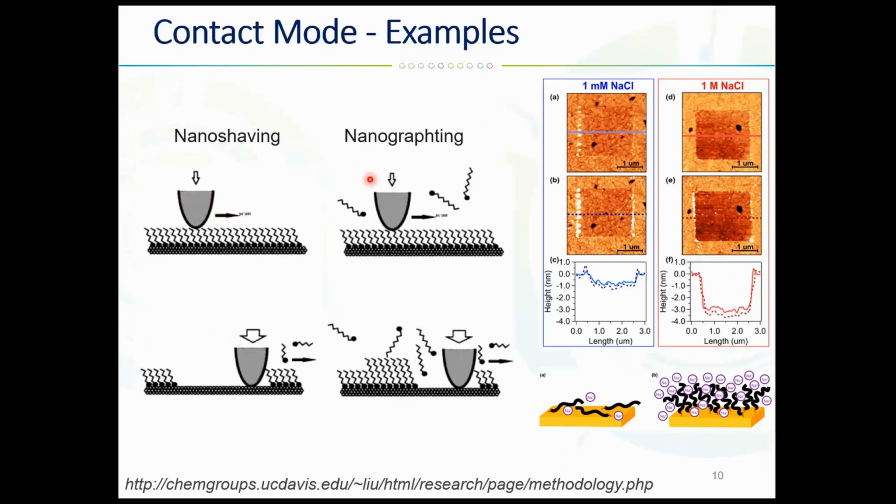Usually for self-assembling monolayers, we acquire pictures in a liquid medium. So the flat substrate here is gold, and these polymers are attached to this gold surface using the thiol group SH, and original surface assessment is done under very low imaging forces. So as you can see, the tip is barely touching the surface here. So very low imaging forces is about 0.05 nanonewtons, so very low.